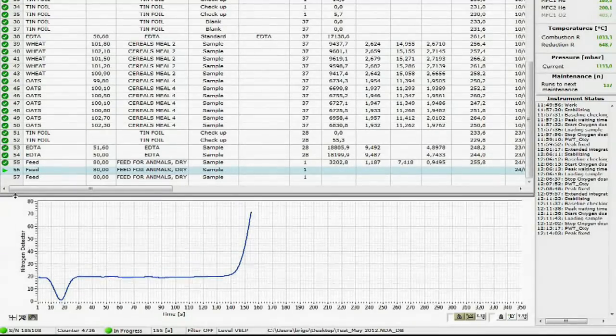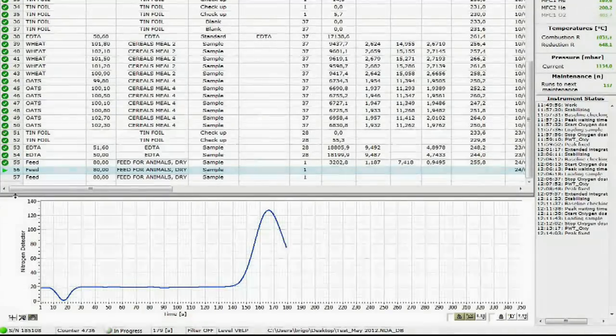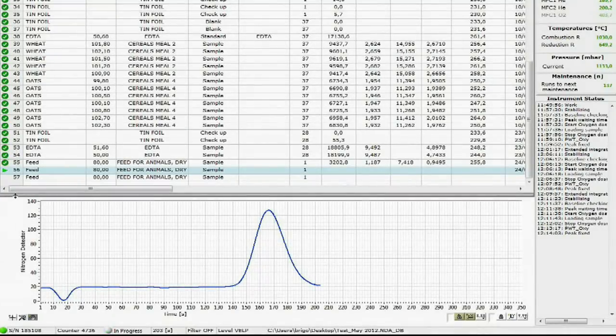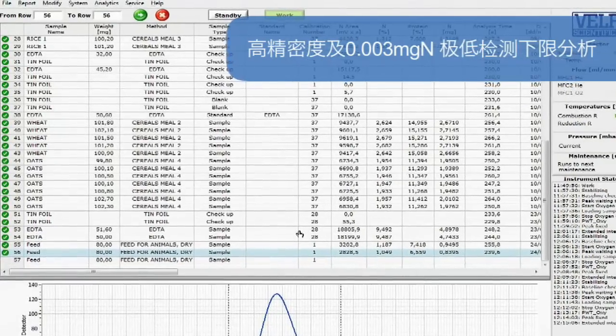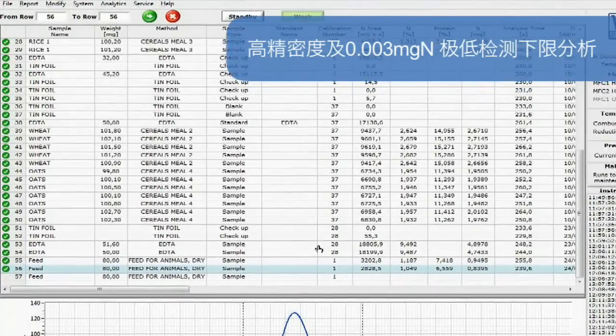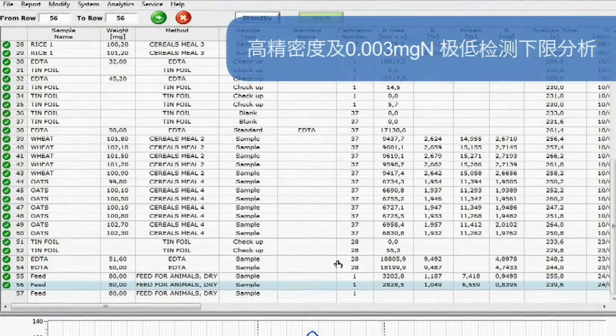The real-time graph shows the progress of the analysis, creating the peak as soon as the nitrogen starts reaching the thermal conductivity detector. The NDA701 provides the highest precision of any such analyzer on the market with the lowest detection limit of 0.003 mg of nitrogen.